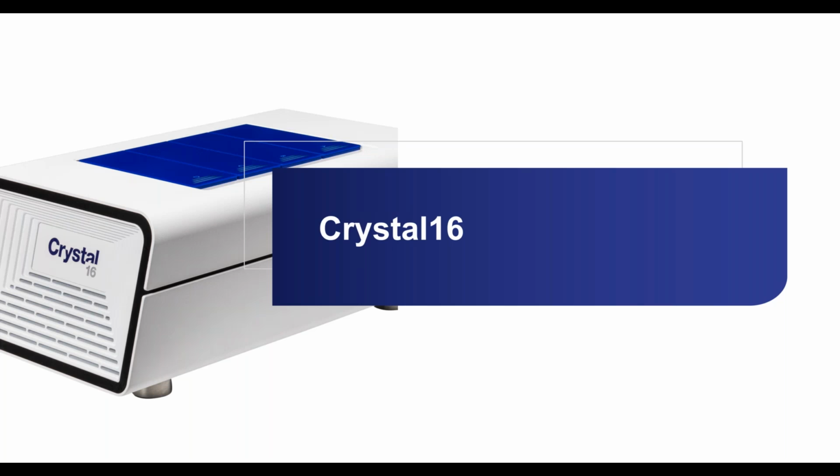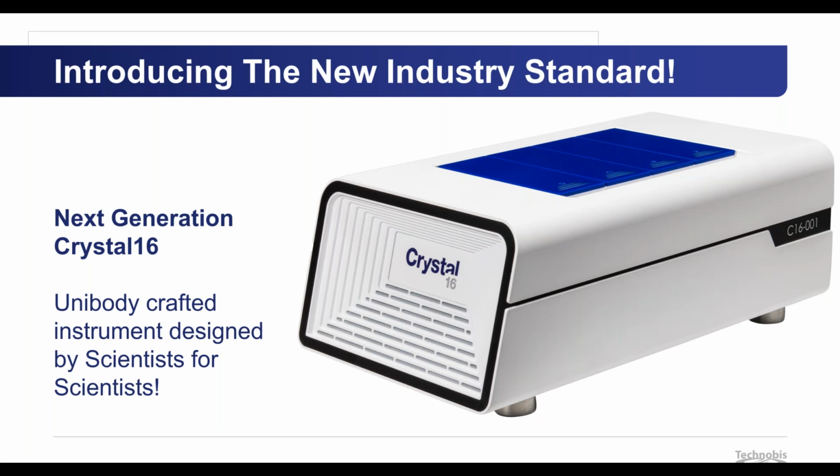And its applications. What can you do with a Crystal16? Hopefully by the end of this webinar, I can give you a good impression and ideas of what you can do and how versatile such a tool and instrument is to have in your lab. And maybe you can also share with me at the end of the webinar any ideas how you would use the Crystal16 differently.